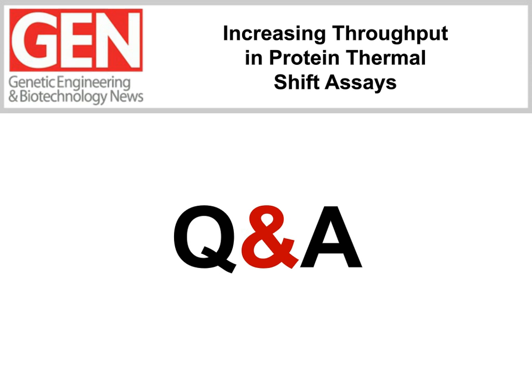protein. For that, you can actually ask the software to define the pre and post melt for a particular peak, and then pick up only that transition event, and then define the Tm for that curve. And that can be done in the software that we'll be launching. Probably the second version will be coming out at the end of the sixth month of the year. Yeah. All right, great.